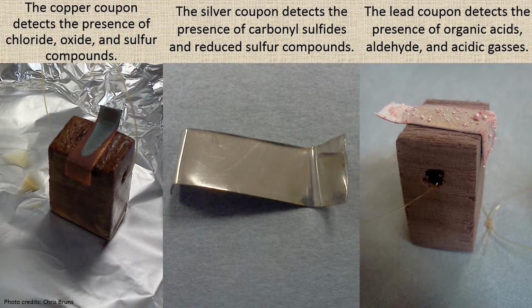After being assessed, the ambient and accelerated tests are photographed together by Joan Neubecker, our department conservation photographer, to document the results and to make it easier and more useful to share our results via the AIC Wiki, which I'll tell you more about in a few minutes.